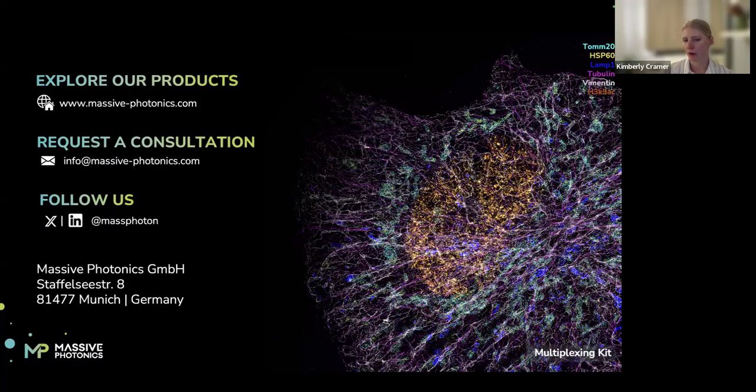For expansion, of course, you don't have to expand the sample, which could potentially cause expansion artifacts. But in general, everything I said in this webinar today, the counting, resolution, multiplexing, it all comes together. That's it. Thank you.